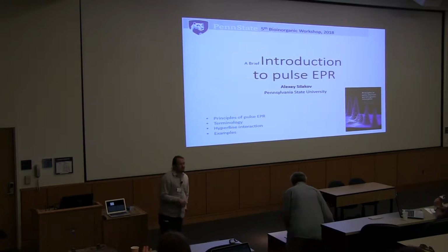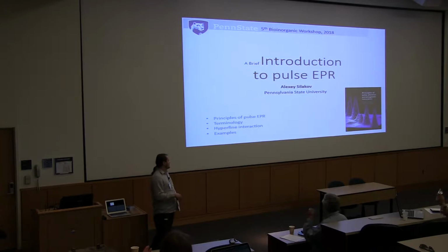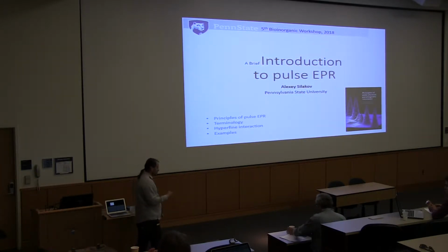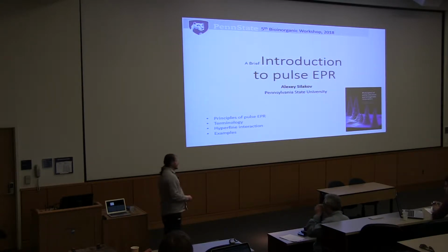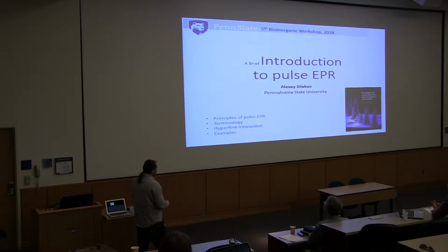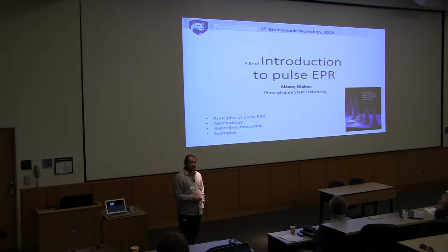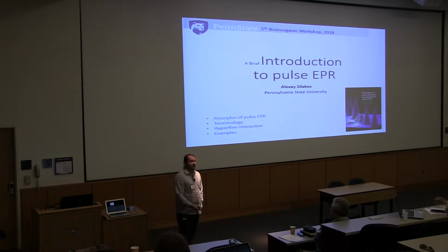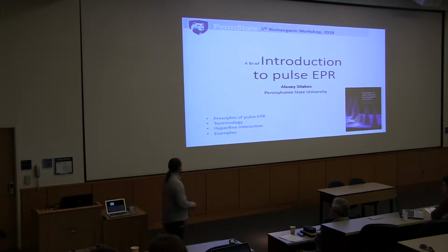It's really hard to talk about pulse EPR in 45 minutes or so. So my goal today is not to educate you how to do pulse EPR, but rather to instruct what the terminology is, what people are talking about when they describe EPR experiments. And we go from there. We'll have an EPR practical, where we'll be talking in more detail about what goes into measuring pulse EPR, and we'll introduce pulse techniques in a little more detail there. So here, mainly we'll be talking about principles.